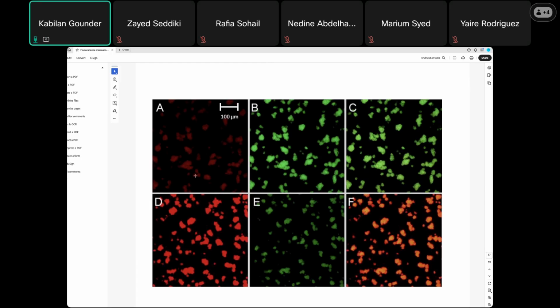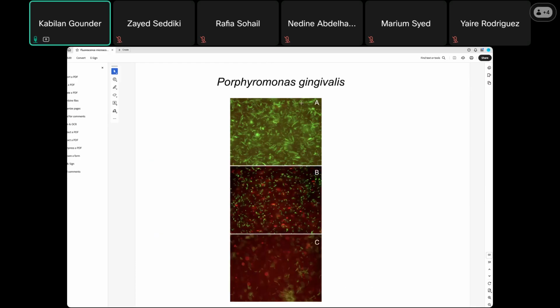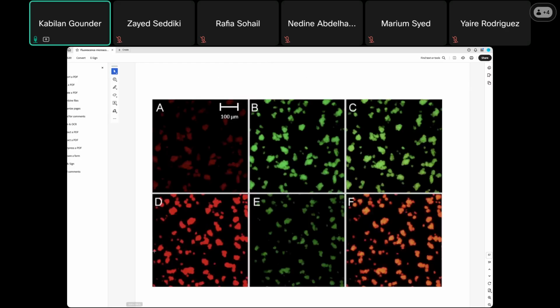So when you look at here, the top panel is healthy cells. We did not add anything; we just grow the bacterial biofilm on the 6-well plate. Whereas the bottom one we grow, but we treated this with the antimicrobial agent, diallyl sulfide.